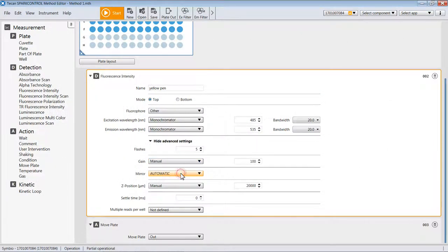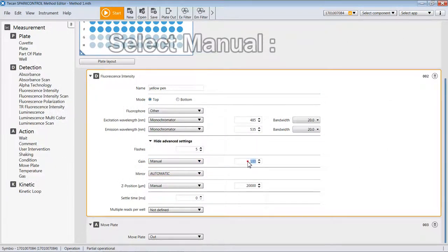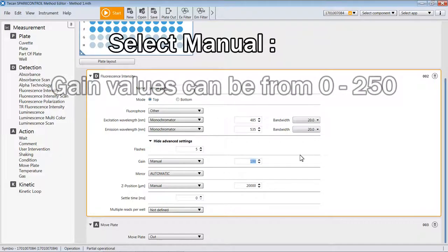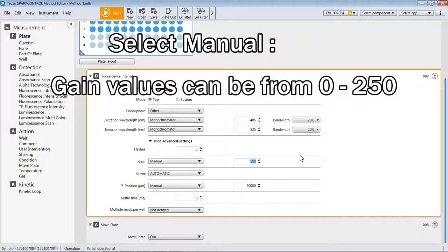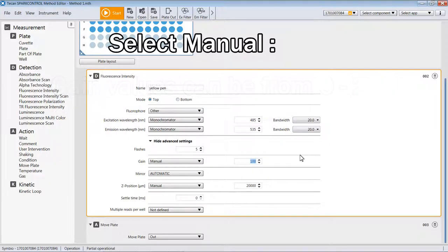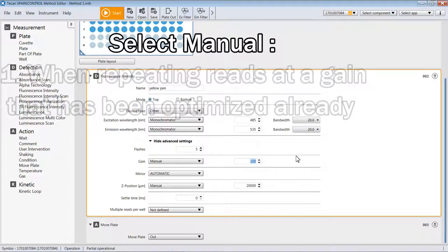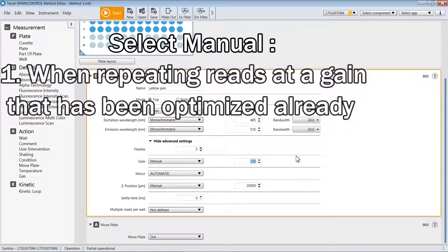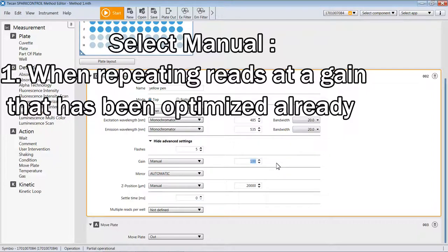Lastly, there is a way of simply fixing the gain manually between a value of 0 to 250, where as you go from a small gain value to a large one, you will increase the amplification of the signal. You will find many cases where you've read the same assay many times, and by choosing optimal gain or calculate from well, you will see a very similar gain appearing for that assay, and therefore you can just simply type in what that gain would be so you're not always having to re-optimize each time.